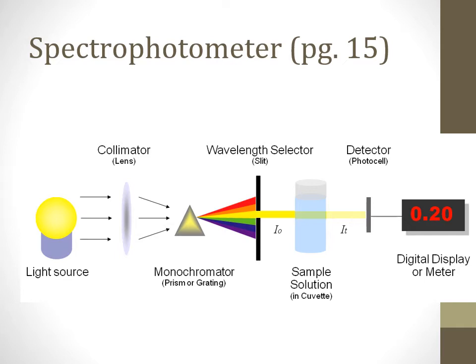And so the wavelength that is most absorbed by a substance is known as the lambda max, the wavelength most absorbed by that solution. And that's what we will use to determine the concentration of beta cyanin in a solution. It's really strange. You can use how much light a solution absorbs. You can use that data to calculate the actual concentration of the solution.